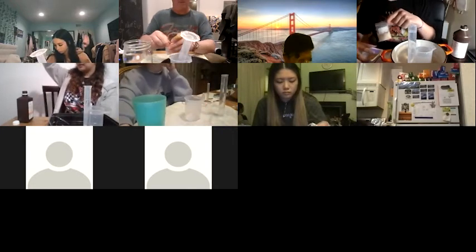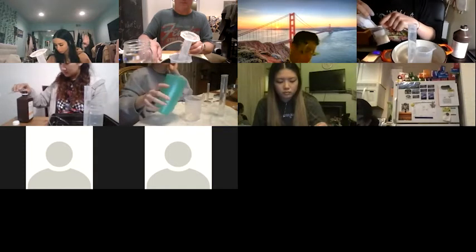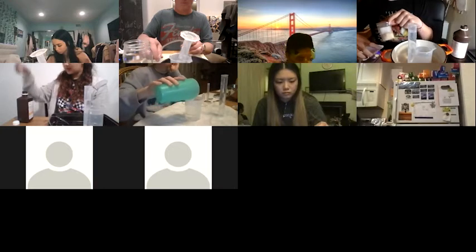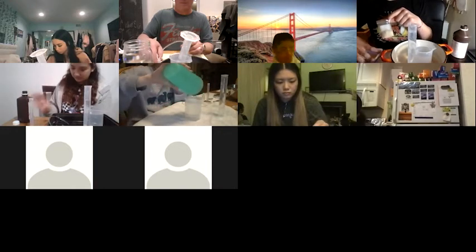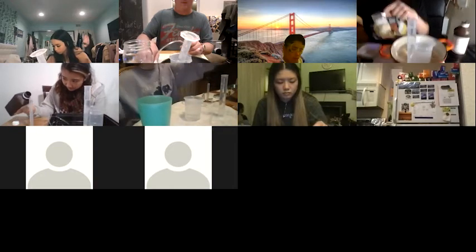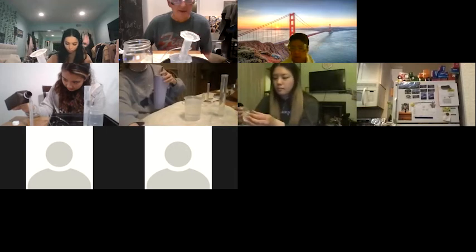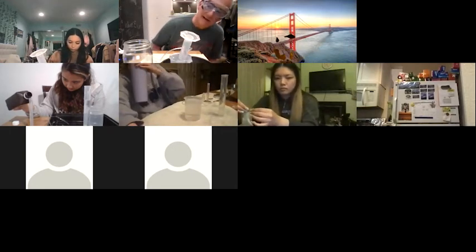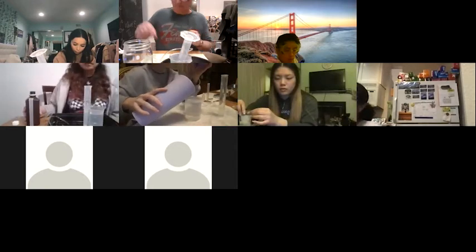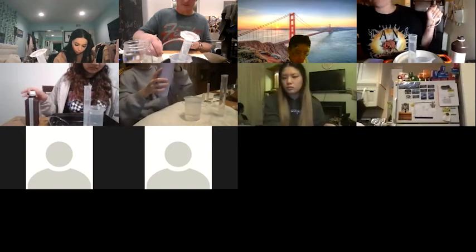There we go. So 3 mils of peroxide, the reaction is happening a little bit faster than it did last time, which makes a little bit of sense. Although I wouldn't have expected it to be this big of a difference.